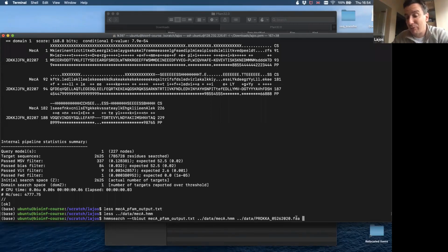So if you have multiple files, you can just merge them and use the FASTA identifier to find out where they were, or you can use whole proteomes or many whole proteomes.